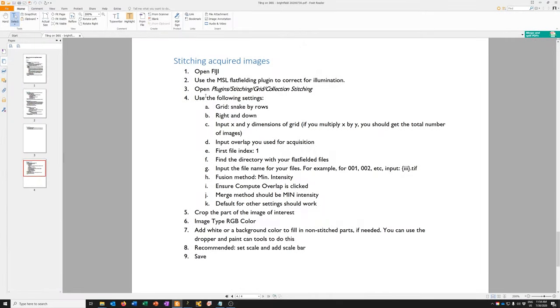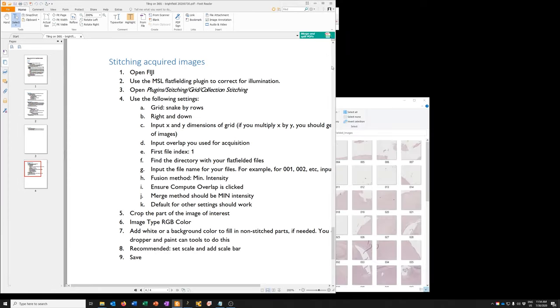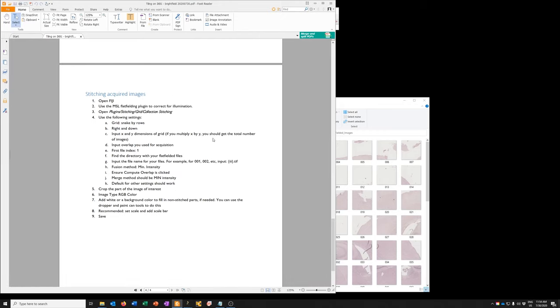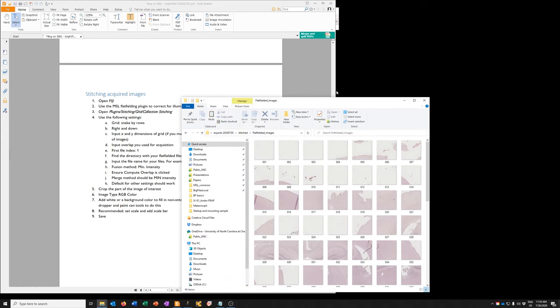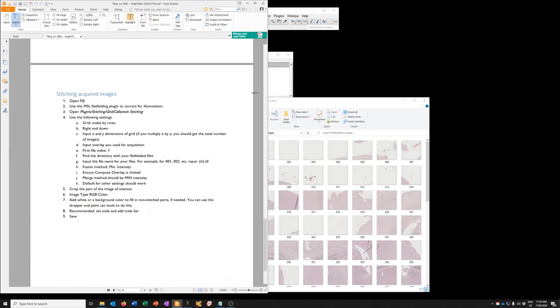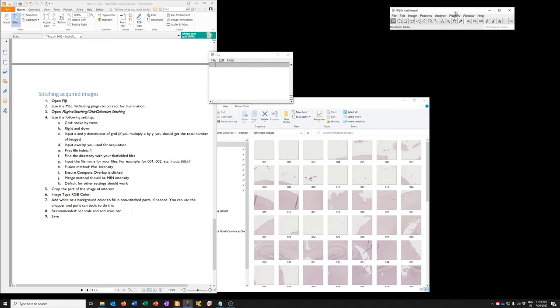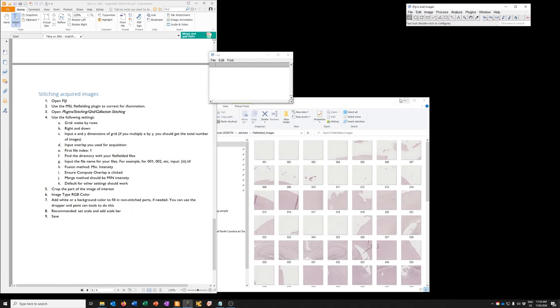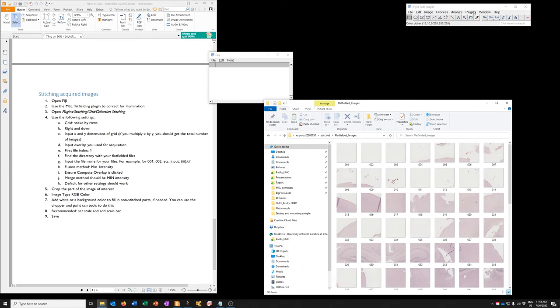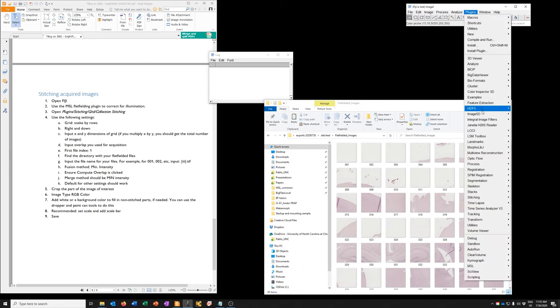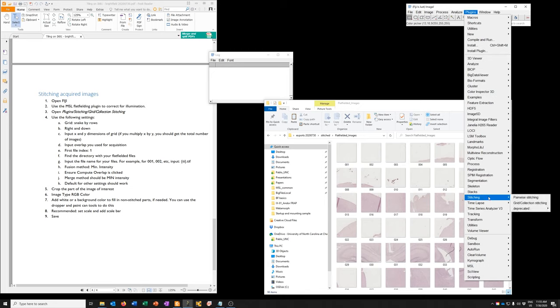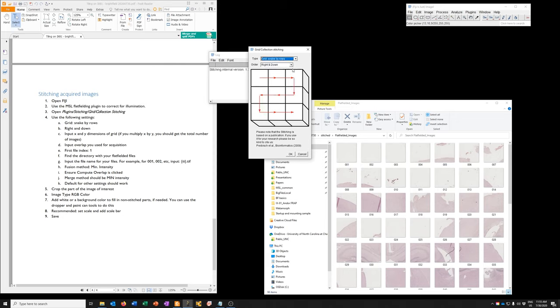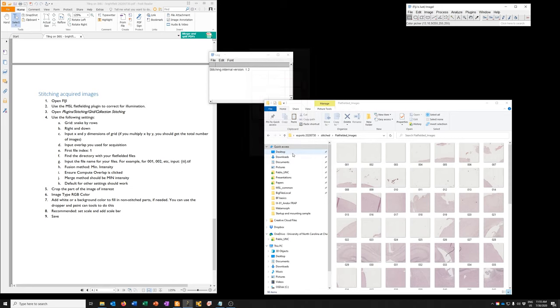So the next step is to open Plugin Stitching, Grid Collection Stitching, and use the following settings. Grid Snake by Rows. Here's where we're telling it how the microscope acquired the images. Order, right and down. That's correct.